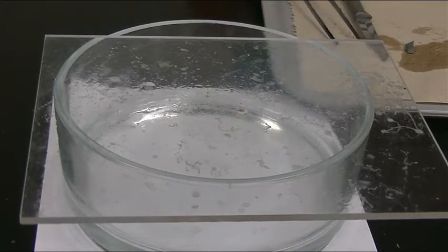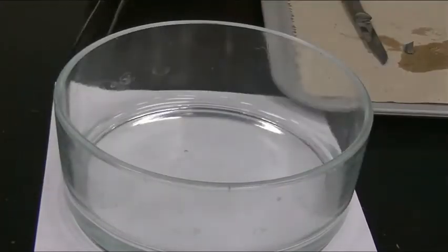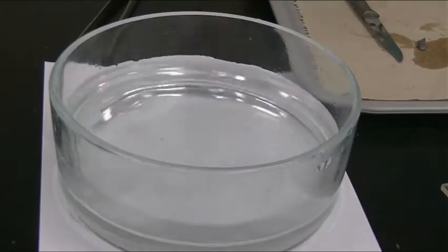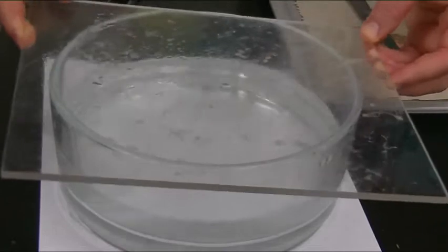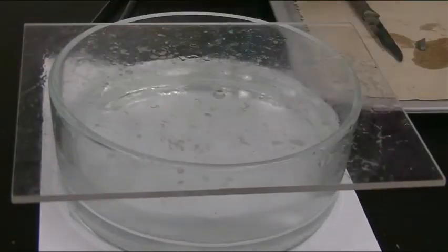All right. So just in case this gets a little attitude, we have a little shield here. Okay, hold on. Oh man. Yeah. All right, just in case it gets a little attitude, I'm going to put this shield on here. We do have water, just tap water inside of the bowl here.